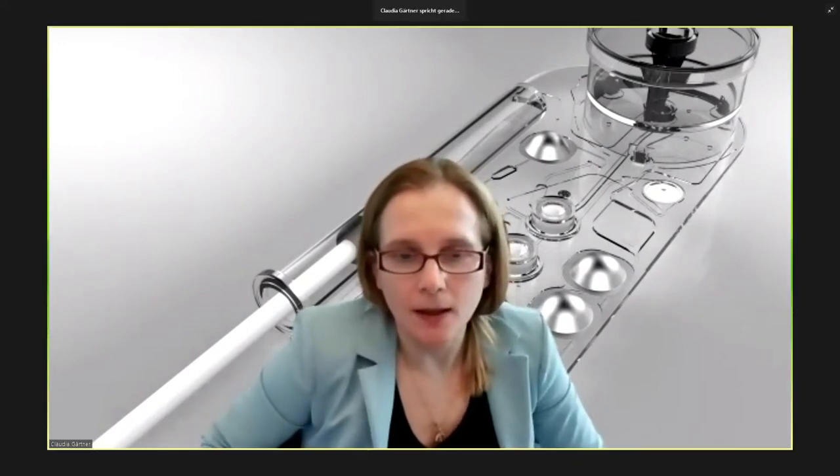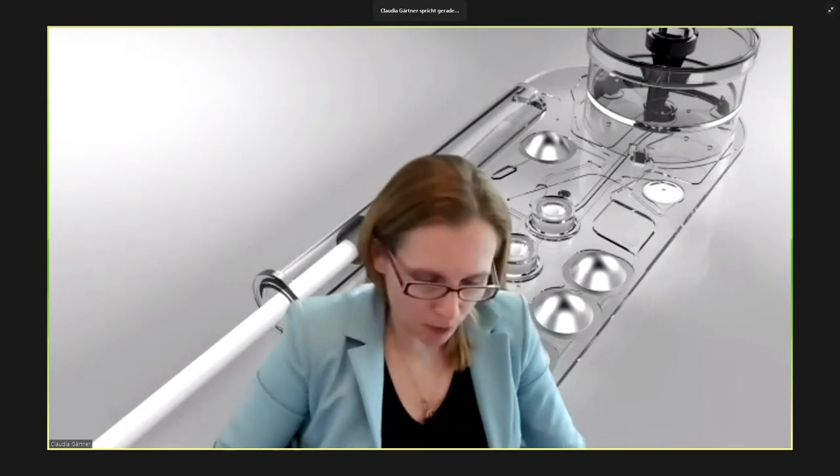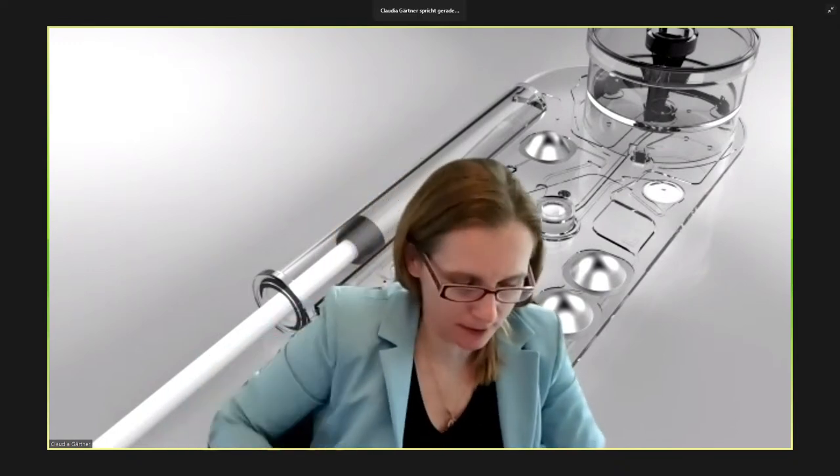We do our own lifetime tests in house, and we've seen that especially regarding liquids, our micropumps easily stand 10,000 hours. Okay. May I get the same question to John from TPP Ventures? How long is your system running?